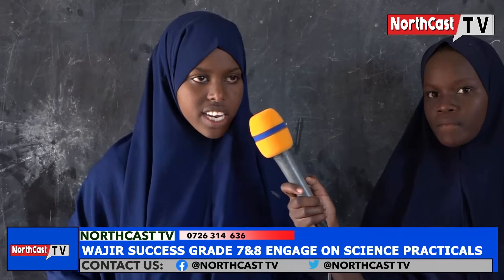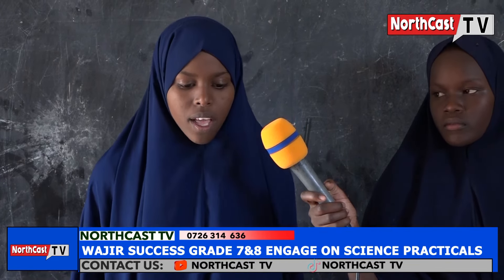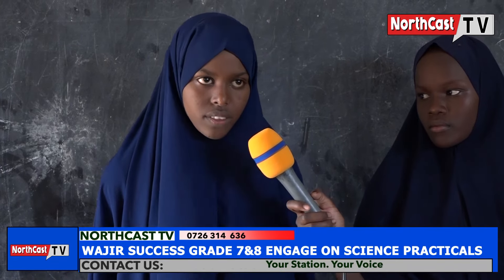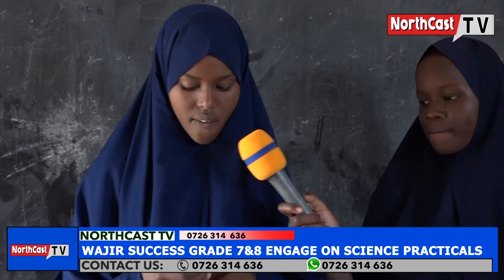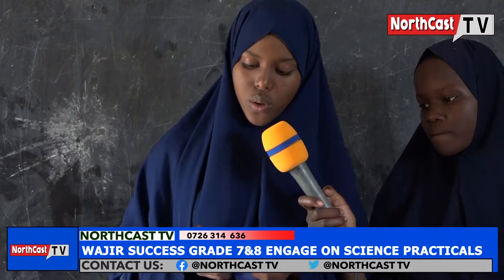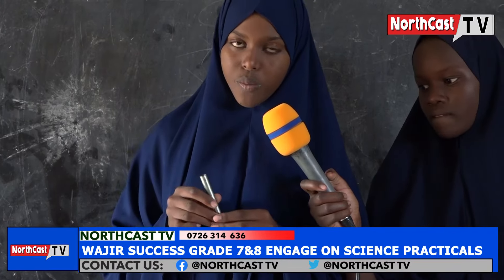My name is Mandak Harun. I am a grade 7 student of OJIA Success Integrated Academy. I want to take you through the parts and functions of a Bunsen burner. A Bunsen burner is the source of heating in the laboratory. We have a chimney — it is a hollow metallic cylinder. On its upper end, a mixture of air and laboratory gas is ignited to produce a flame.